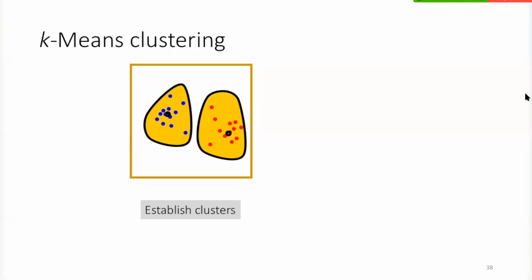And there are different ways to cut. So now I only showed you one horizontal line to cut, but there are ways to cut the tree in a very funky way. But you still specify clusters. We'll get to that at the end. So nobody should sell you a method that does not specify the number of clusters. At some point, you make a choice about the number of clusters.